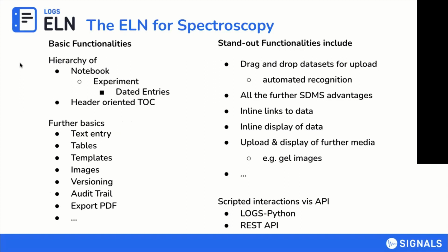The ELN is already being used by the first users, especially on the campus that I showed you in Frankfurt. And we are happy to have the necessary basic functionalities. We still have a long roadmap ahead of us, but we think it's very usable. I'll show you why in a moment.